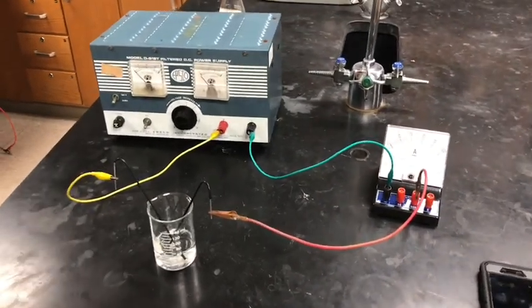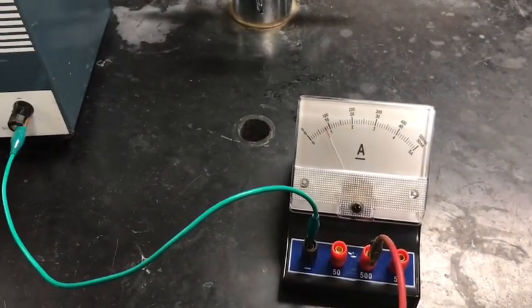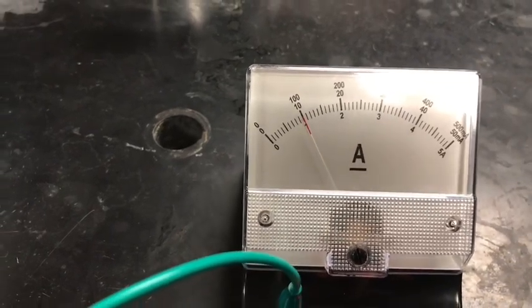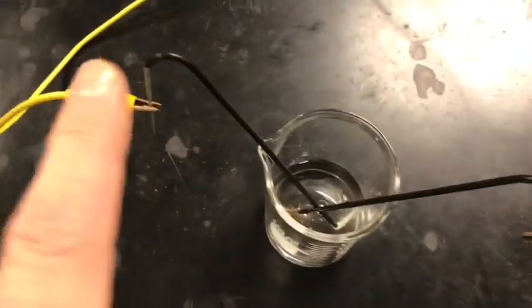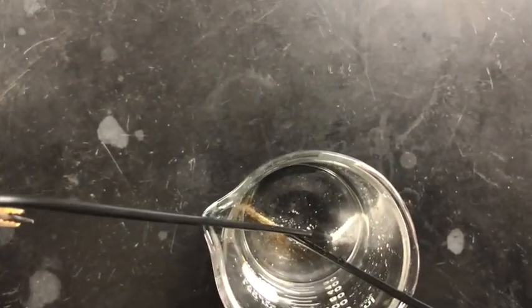Okay, ready — putting the power supply on. Getting the timer going. Timer's good, and that looks great: 100 milliamps, 0.1 amp. We'll show the beaker now. This is the positive side and over here is the negative side — just follow where those things are going and we can make some observations.